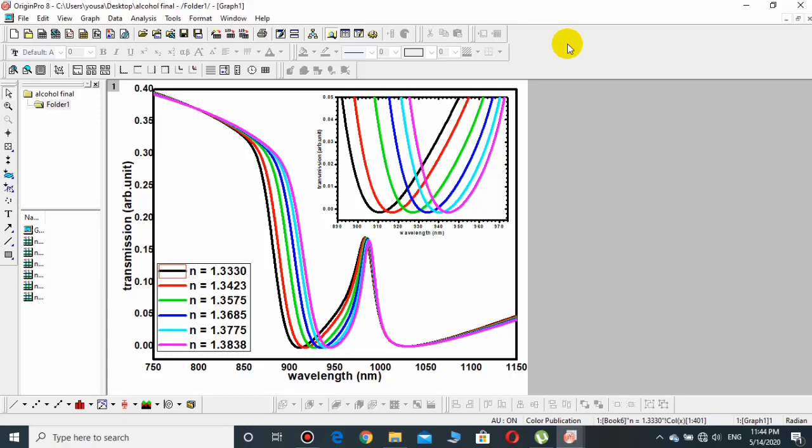Hello friends, this is Mohammed Aftab and you are watching Alpha Science Academy. If you are working in Origin Lab and you have drawn a graph just like this graph and you want to convert it into a picture just like PNG or JPG, this video is for you. Let's see how it works. From the top menu, click over file.